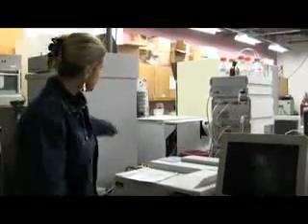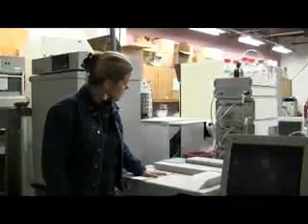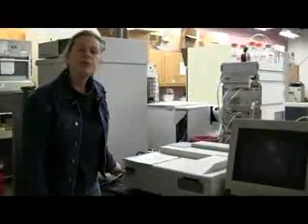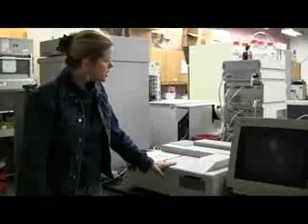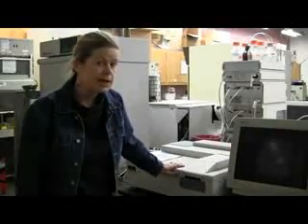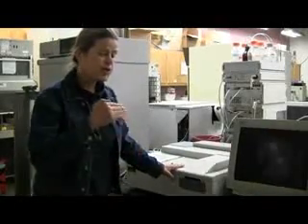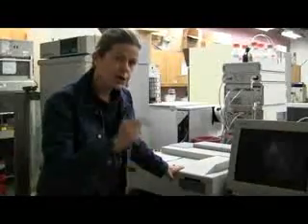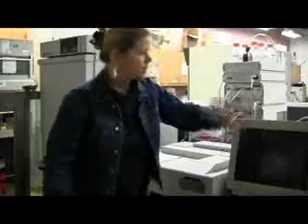We're going to have a lecture on using the UV visible spectrophotometer. This is a Cadillac spectrophotometer. It is a Perkin-Elmer Lambda 35 spectrophotometer. This one is particularly useful for doing enzyme kinetics because it can measure the absorbance at a fixed wavelength over a period of time and store the data on the computer.